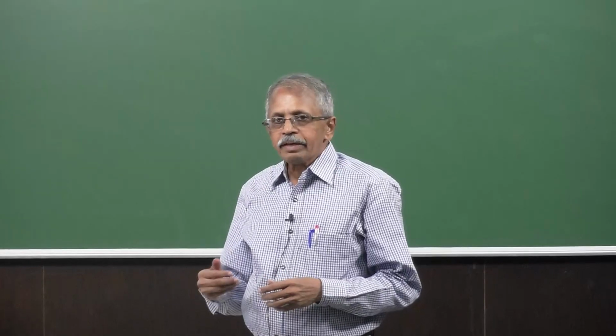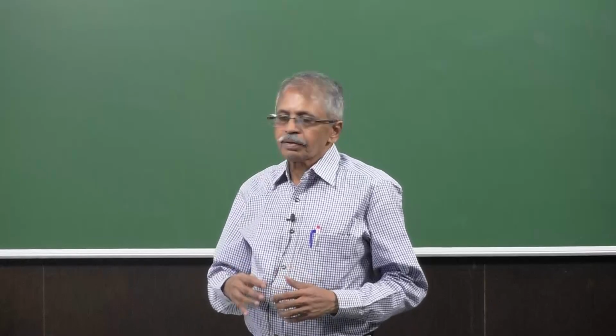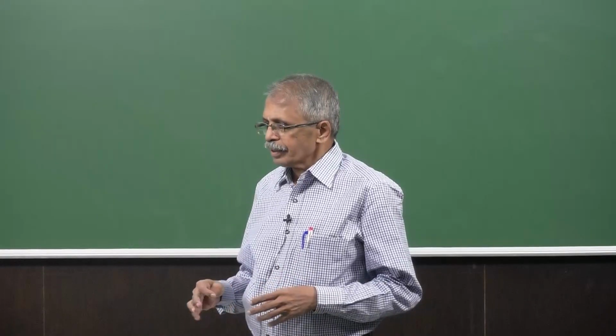Okay, these are all again made for some purpose. In this particular case, mechanical properties is their purpose. Of course you have to synthesize and optimize the conditions, which we will not do in these slides. And of course the synthesis, characterization and the properties. In the characterization, TEM is going to be the helpful one.